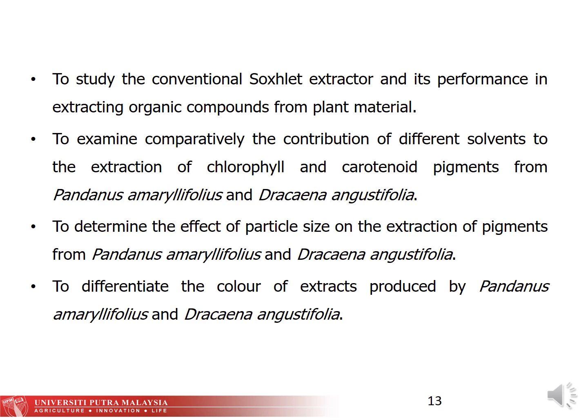Now I will state the objectives of my research. First, to study the conventional Soxhlet extractor and its performance in extracting organic compounds from plant material. Second, to examine comparatively the contribution of different solvents to the extraction of chlorophyll and carotenoid pigments from Pandanus amaryllifolius and Dracaena angustifolia. Third is to determine the effect of particle size on the extraction of pigments from Pandanus amaryllifolius and Dracaena angustifolia. Fourth is to differentiate the color of extract produced by Pandanus amaryllifolius and Dracaena angustifolia.